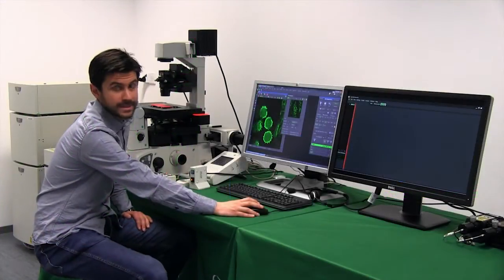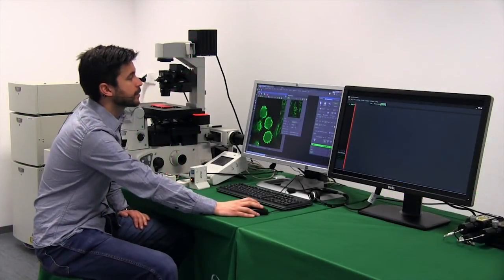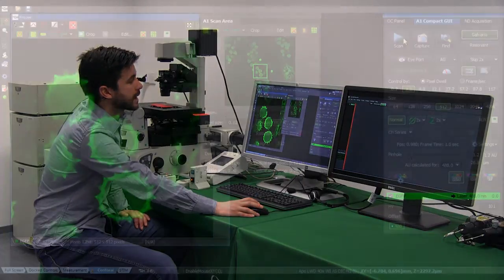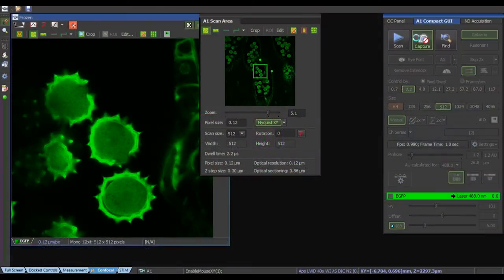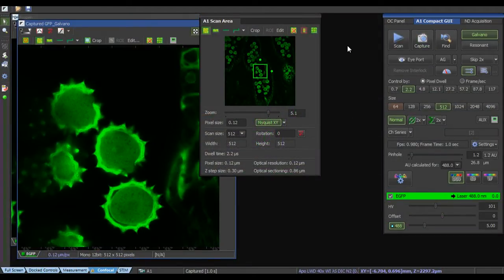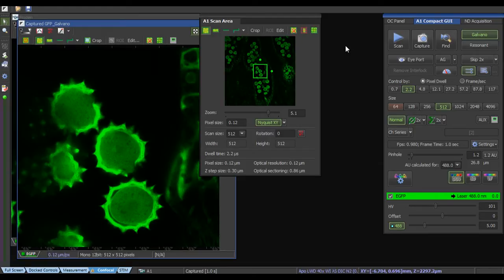If we would like to have a snapshot of that we only have to go to capture and then the image is saved in the PC from Nikon.